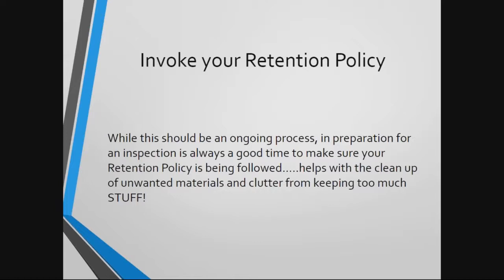I always tell my staff a great way to declutter your department is to make sure you are following your retention policy. So keep what you need to, and that's it. Keeping things longer than you need to is just as much of an issue as not retaining items for the correct length of time. Reviewing your retention policy should be an ongoing process, obviously, but double checking this before inspection is an effective organizational tool.